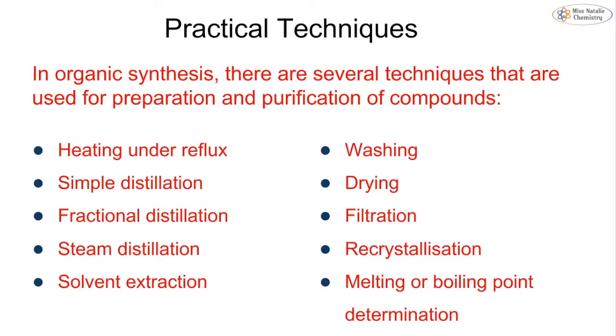So for organic synthesis, we do have lots of techniques that I just mentioned there, and they're all about the preparation and the purification of compounds. You need to know what each of the techniques are, you need to be able to draw a diagram, and you need to be able to describe each of them. So I'll go through them in this video, but you may also want to try to find some other practical videos where you can physically see the techniques being done. Alternatively, try and see if you can get a chance to do them in the lab at school. But we know that that may not always be possible.